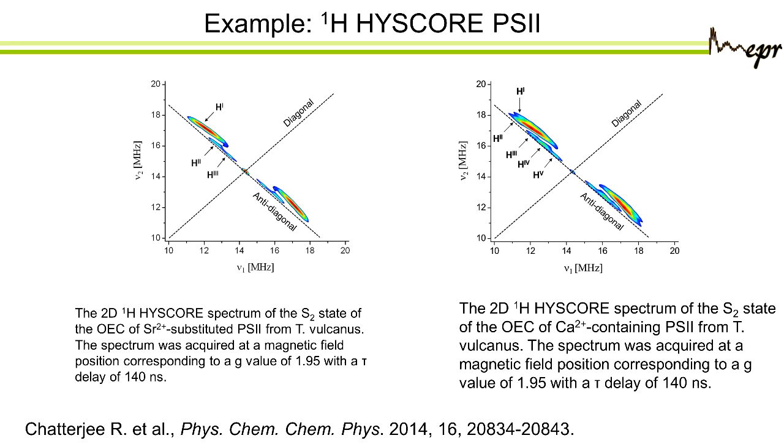Now, when they looked at the complex with calcium, the spectrum is different. You see here they could recognize 2 more protons. So you can really differentiate 5 ridges here, and then they continued to analyze this and learn something about the structure of this complex. I will not go into it, but you see that it's rather clear to identify the different protons.